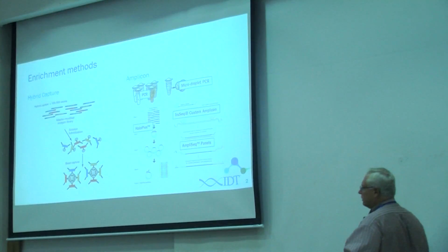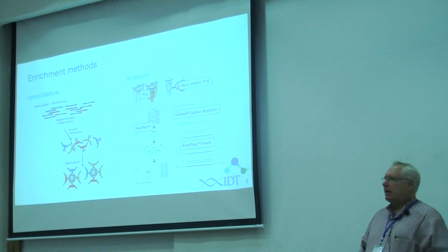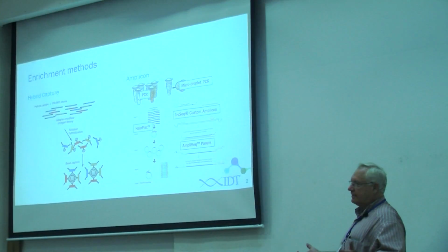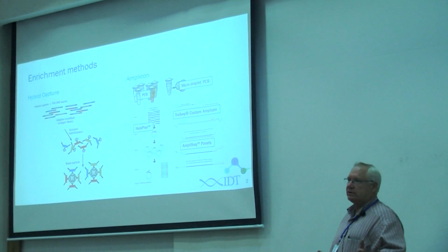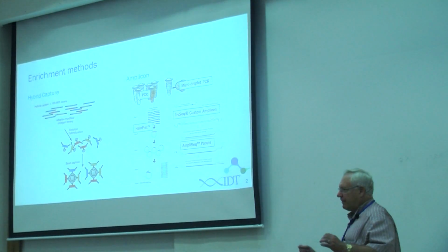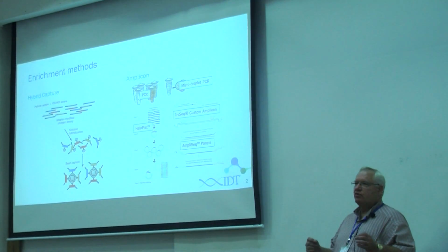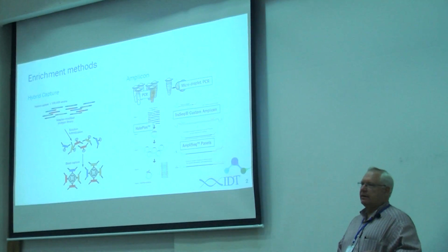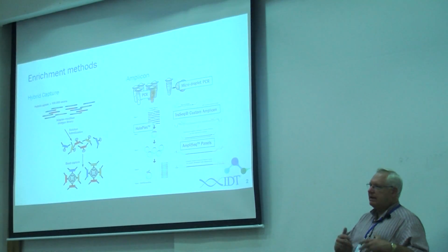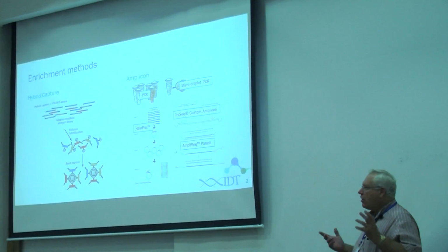And if you're beginning to look at oncology type questions, you're not talking about germline mutations, which are usually going to be 50-50. You're talking about events that may be present in a cell population at 1 in 100 or less. And to do that, you need to have depth of sequencing. So you don't need 10x, you don't need 30x, you need 200x, you need 500x sequencing to go down deep enough into the sequence space so that you can really have any assurance that you're catching some kind of rare mutation.